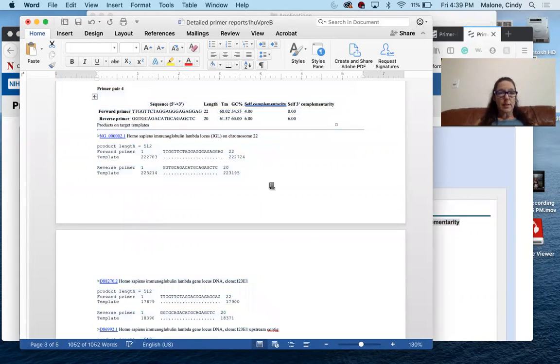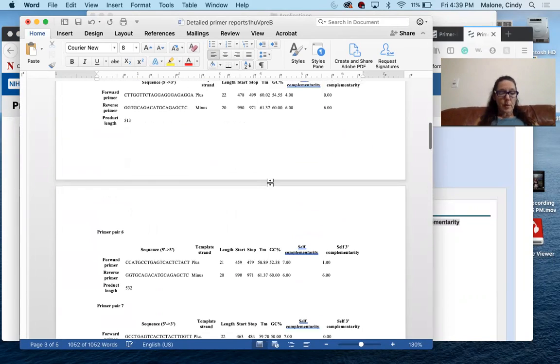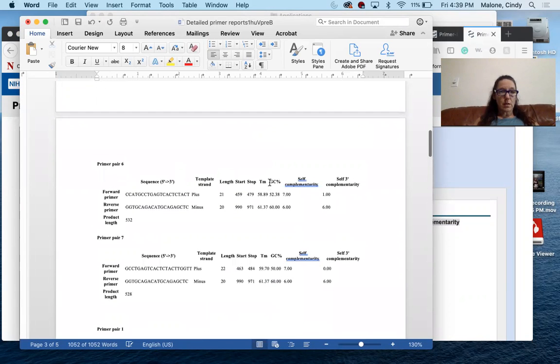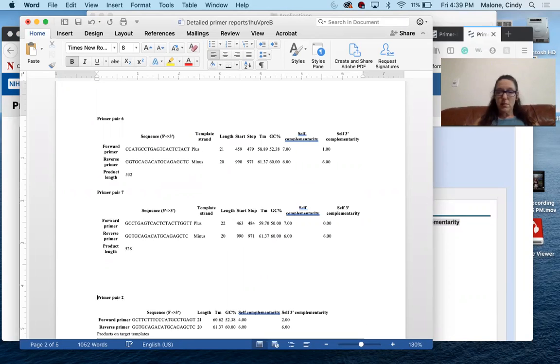Oh, it's not crazy. These are our primer pairs still, right? No, that's our check. Oh, okay. So it's not primer pair 1, it's primer pair 2, and I'm going to call it primer check. Okay. So that's all we have to do.